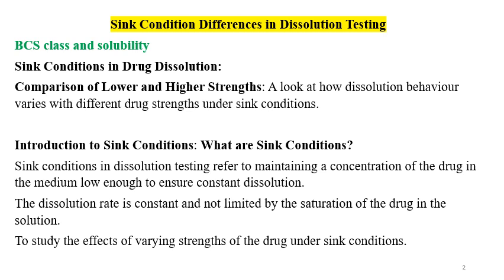For example, if the strength is 500 mg for the formulation, then the dissolution volume should be such that it can dissolve at least 1500 mg of the API. The dissolution media may or may not contain surfactant. The dissolution media volume may be 500 ml, 750 ml, 900 ml or 1000 ml depending on the formulation.